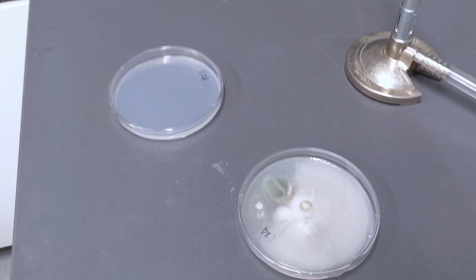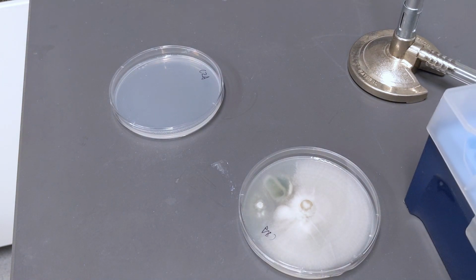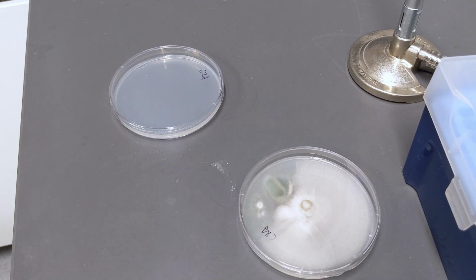First, we prepare an agar plate with food that P. rubens love. Under an aseptic environment, we use autoclaved pipette tips or any other sterile tools with similar shape to cut a circular piece of agar off the original agar plate.